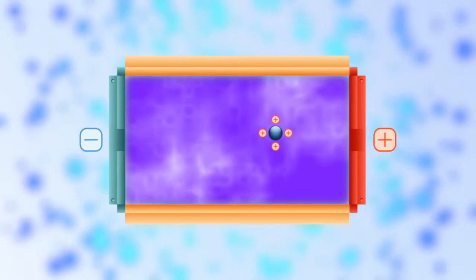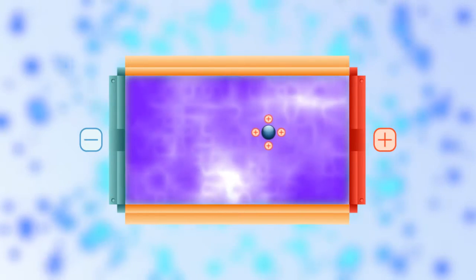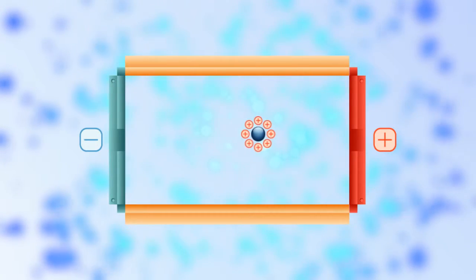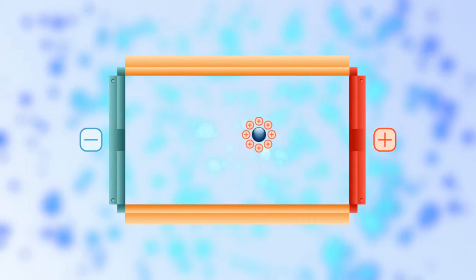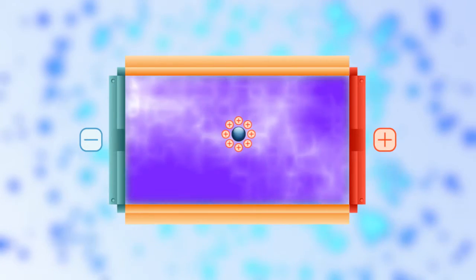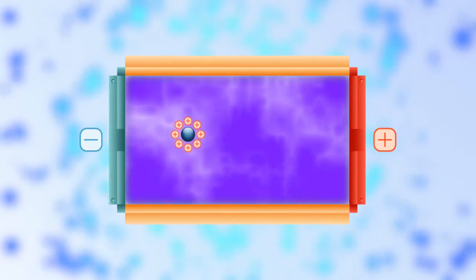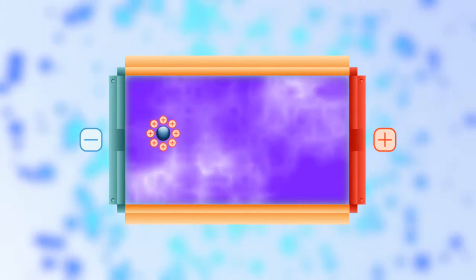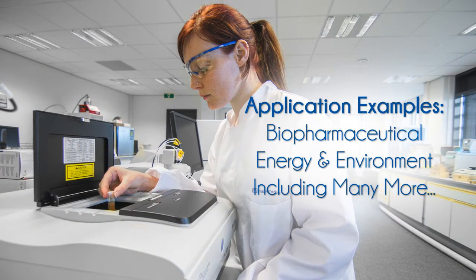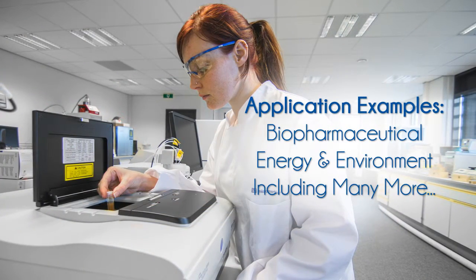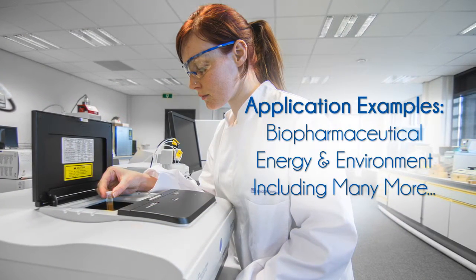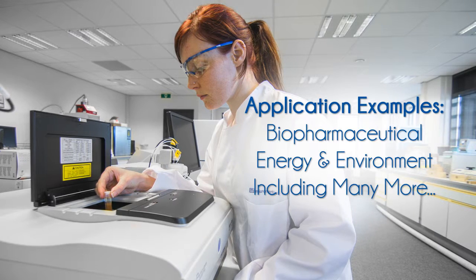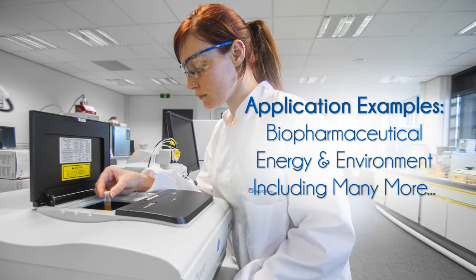ELS determines the electrical potential, or zeta potential, in the suspension that can cause particles to attract to each other or repel each other. The Nano Plus is a unique tool that can determine both size by backscattering DLS and zeta potential by ELS.